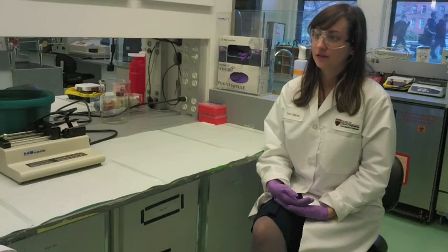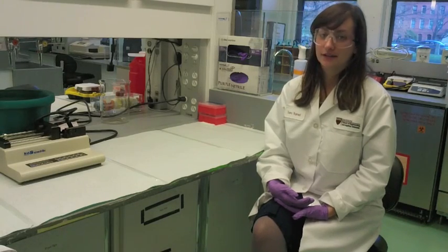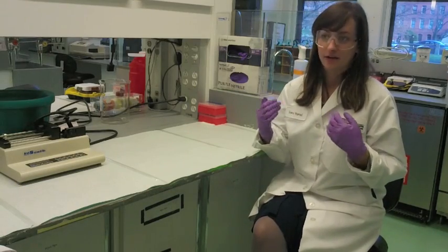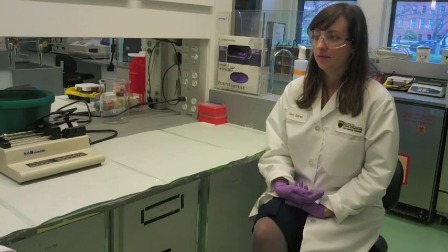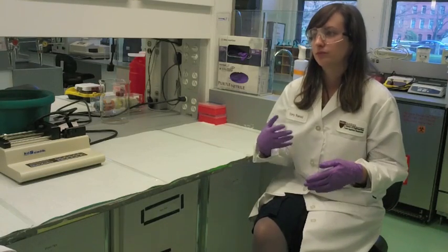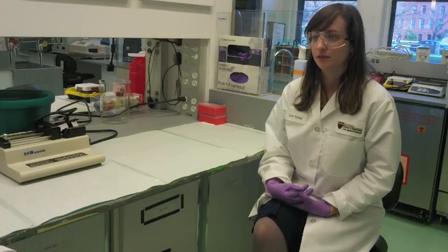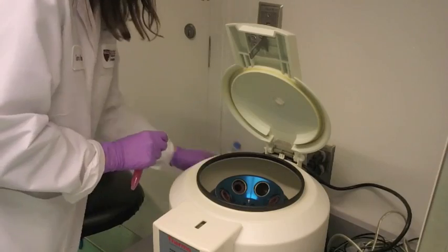It would cut down time that you need to passage. It would cut down the amount of people interacting with the cell lines. It would cut down contamination. It would cut down a lot of external factors that might contribute to losing your cell line or not having as robust a cell line as you need.